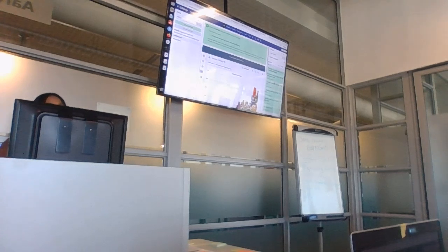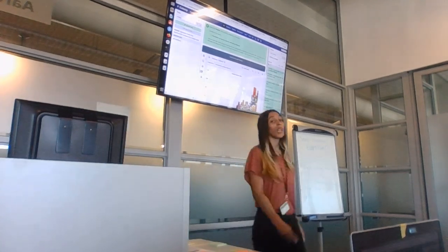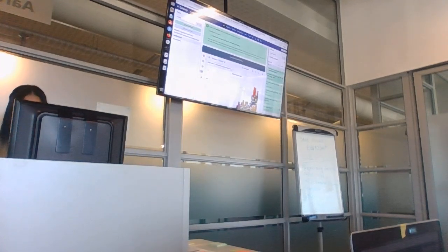I'm not going to open it because I want you to open it. Where would you go to open it? To look at the content of your file. Firstly, you've got 2 files. So which one will you even choose? The first, because the second doesn't even have an eye. But if you wanted to, you could open it and see what's in it. By the way, if you click on it and you want to go back, use that button.